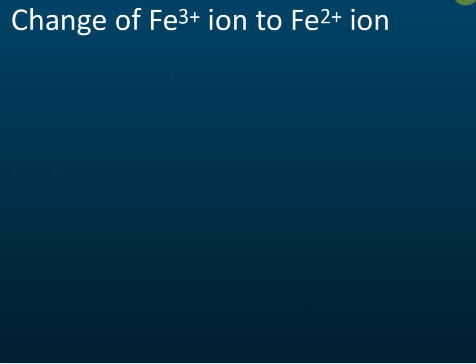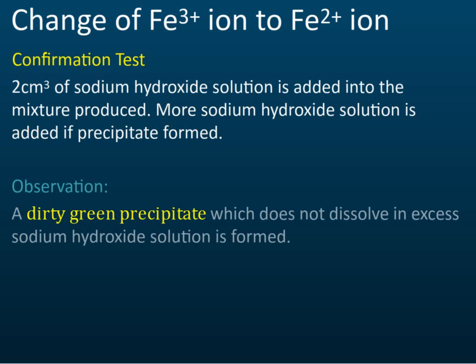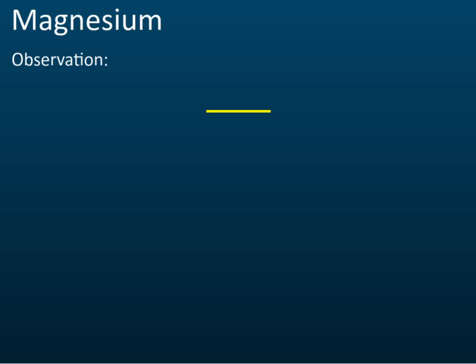Confirmation test for iron 2 ion: add sodium hydroxide to see whether a precipitate forms. Add more sodium hydroxide and observe the color. The solution forms a dark dirty green precipitate, which does not dissolve in excess sodium hydroxide. This dirty green precipitate confirms the presence of iron 2 ion.